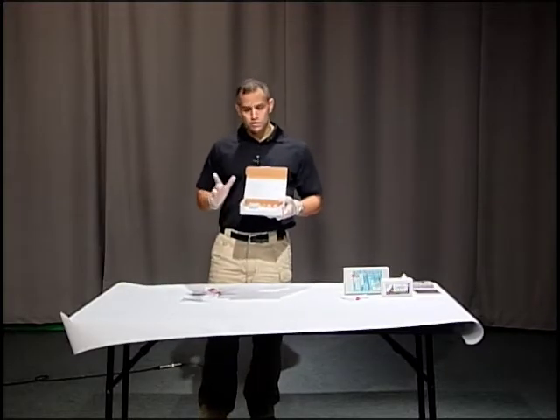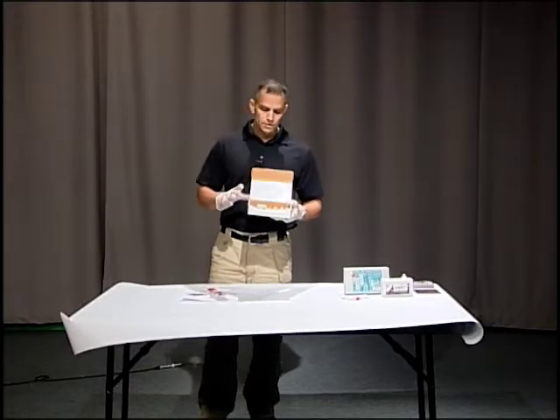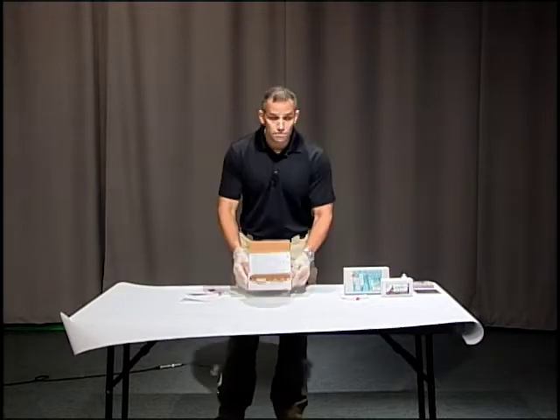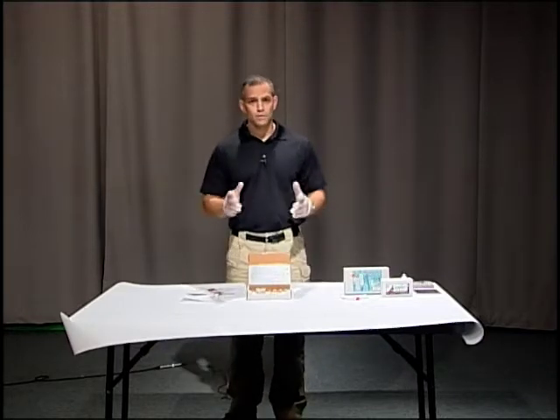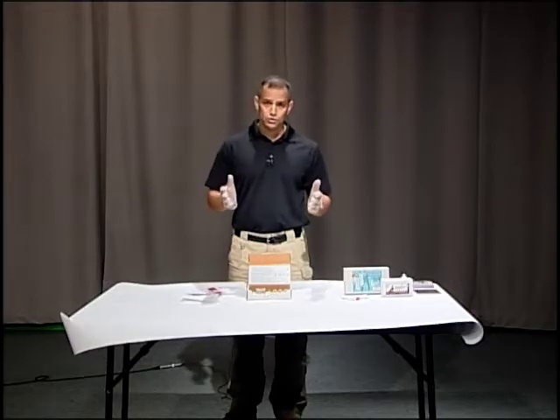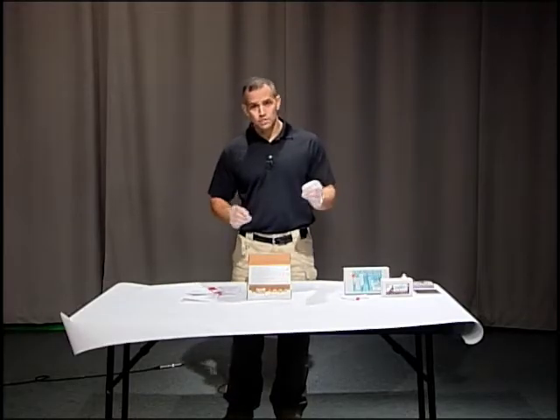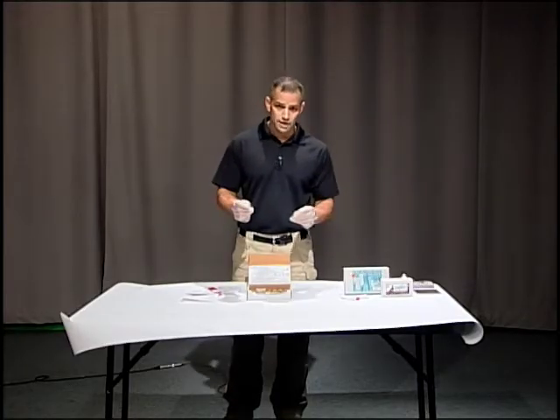The first test we're going to do is collecting the evidence we want to send to the lab, because that's going to give us the most accurate information on whether someone handled the gun, whether they fired it, or whether they were in close proximity when it was fired. We want to collect that sample first before we do our field test.